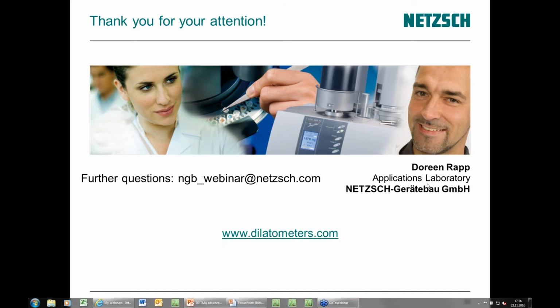So usually I would go in the direction of TMA, but for some applications, for example, if you have samples with really low expansion like fiber reinforced polymers, then it might be better to go to the dilatometer, where you can measure larger samples, and in this case also with a higher resolution.